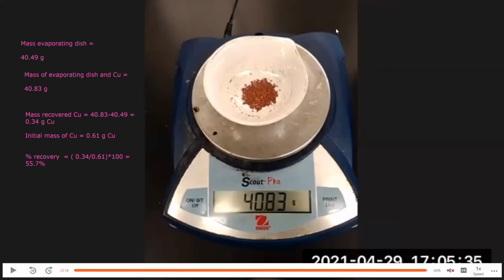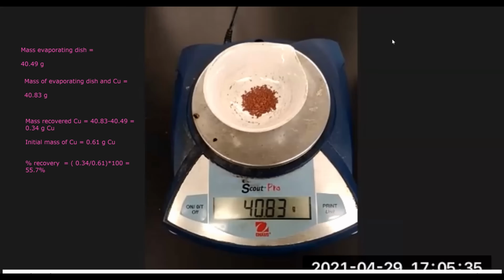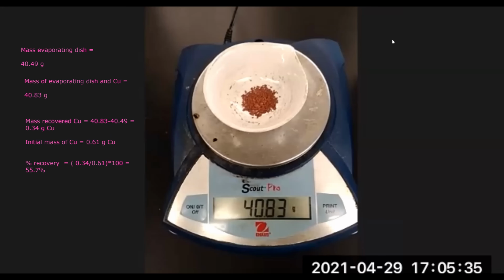And as far as the waste, please make sure to put the copper in the solid waste, not in the glass bottles. There will be a white container that'll say copper waste, copper solid waste. Make sure you put the copper solid waste into the solid waste container, which is usually a white plastic container or a beaker. The solutions that you extracted at all the different points in the lab should go in the aqueous waste, usually a glass bottle. And the organic solvents that you use for washing usually will have their own separate container as well.